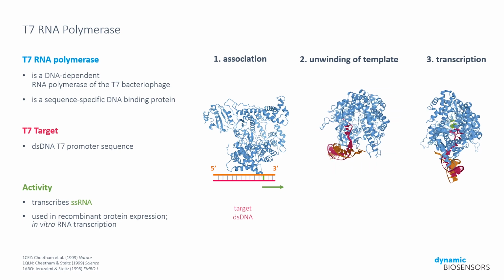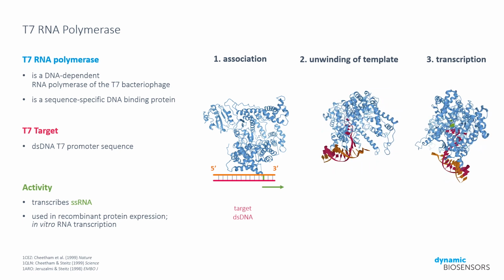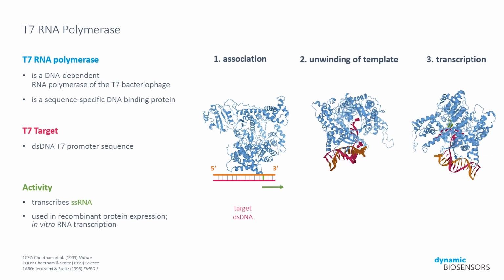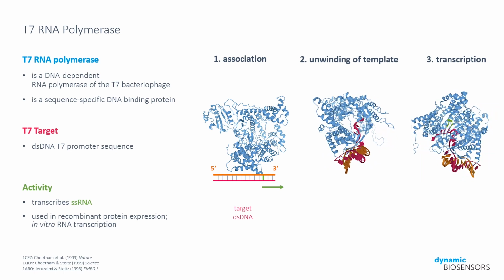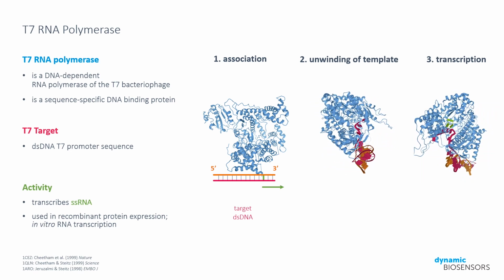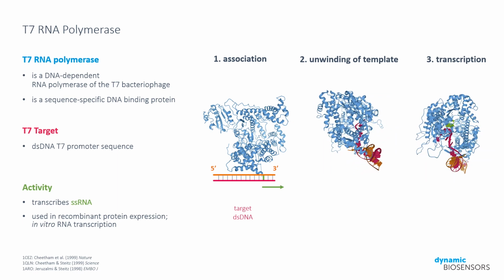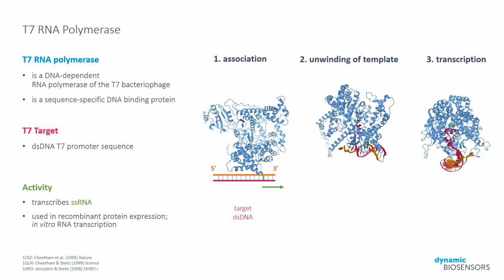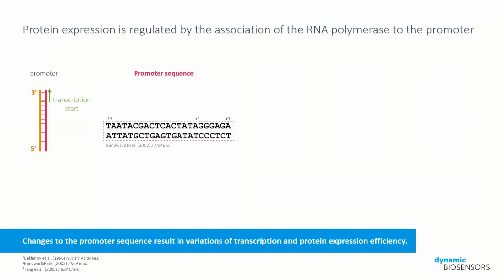Since the first step, the association, is a crucial rate-limiting step that regulates transcription efficiency of the polymerase, it is often targeted for regulating the expression level during recombinant protein expression or for in vitro RNA transcription. Let's take a closer look at the regulation by varying the promoter sequence. Previous studies on T7 RNA polymerase binding to its promoter have narrowed down the core sequence for binding and transcription initiation to the DNA sequence shown here.